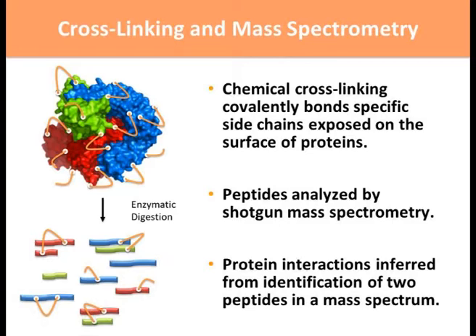But if you want to try and work out what that spatial interaction is, does that protein actually sit here, or does it sit here, or does it sit here? We use this protein cross-link and say if there's two peptides, if they're bound together by a cross-link, they must be close together. So that gives us this capability of working out what the 3D structure is of proteins. But to do that at the mass spectrometry level is very, very difficult.